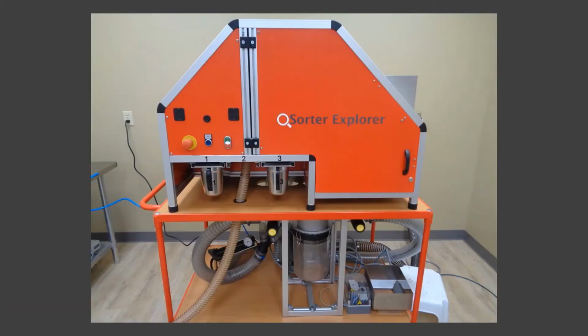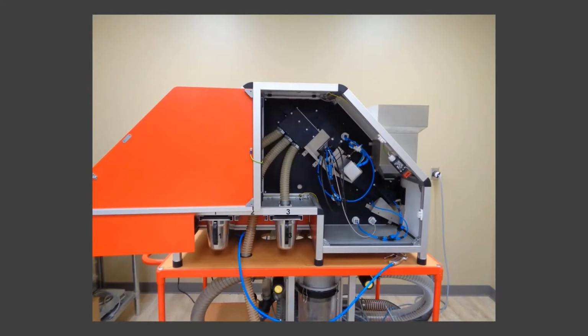Here's a picture of the Qsorter. First, a sorting property is selected using the computer program. For this study, we selected oleic acid. A batch of peanuts is loaded into the hopper. The air pump below provides a vacuum system to pull kernels onto the unique belt delivery system, which allows for fixed position delivery of the individual kernels to the vision and NIR systems.